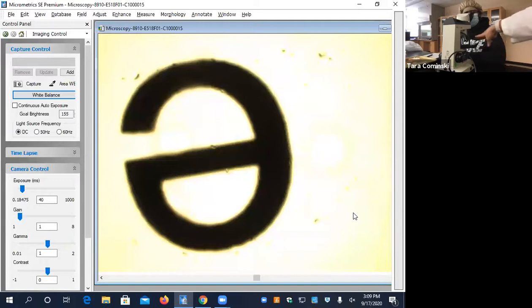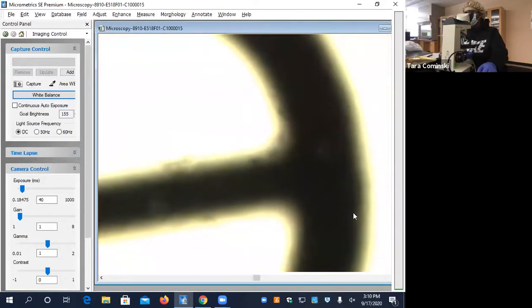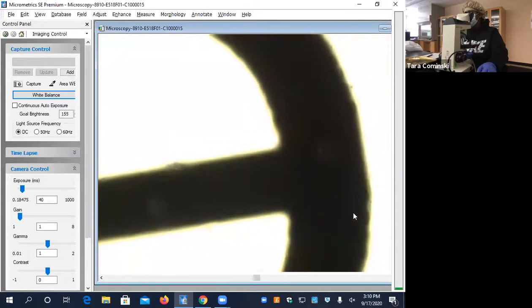It's the same thing. If you look at the side, it probably will tell you somewhere. I still see it even a little more blurry. Yeah, so I'll show you. Look, now it's 10x. The low power objective is 10x. So if I switch it, look, right? Mine's a little different, the field of view, but anyway. Right now you can see part of the E, but it's much more magnified, right? In yours, I think usually because of the way that camera is, you probably can see the whole E, but it's bigger.